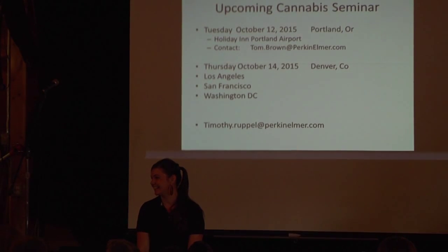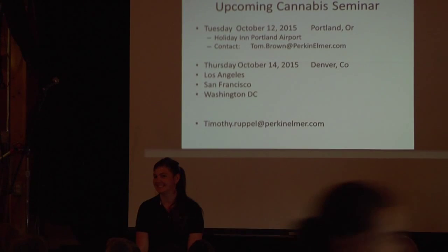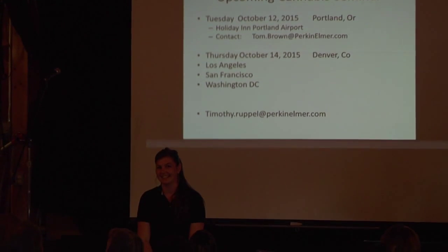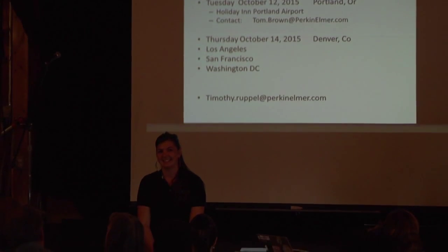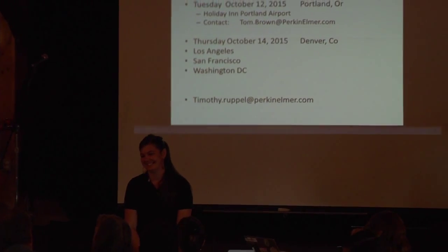I can tell you how to analyze for them and tell what they are there, and if they do become larger terpenes, then they're no longer volatile enough to go into headspace, and now I need to use a liquid injection in order to determine what they are and how much of that is actually going on. So I'm afraid I would have to defer to somebody who has more experience in botanical chemistry than I do.